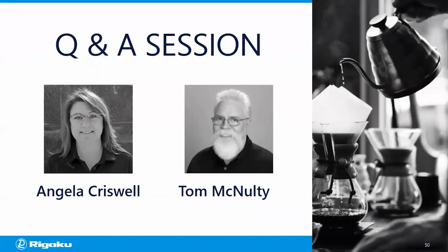Okay, we have a couple of questions now from Ula. She's asked three in sequence. The first question was, which instrument was used to scan the millet seed? For the millet seed, in that case, we used both the Nano 3DX as well as the HX130. The high resolution images that you see in that case were from the Nano 3DX, and we used copper radiation in that case, 8 keV.